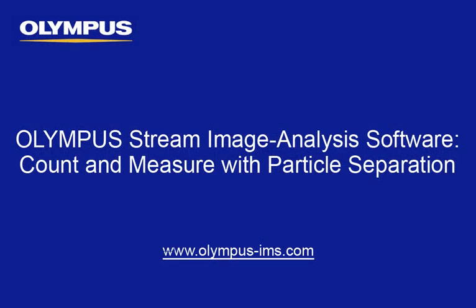This tutorial is one of many instructional videos presented by the Olympus Industrial Equipment Group. This tutorial video will provide you with detailed instructions to perform count and measure with particle separation within the Olympus Stream image analysis software.